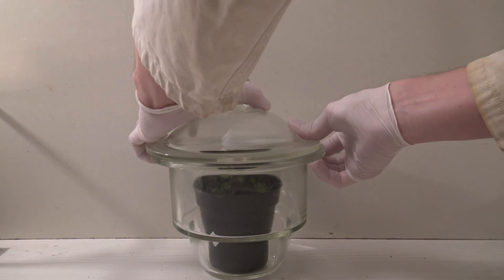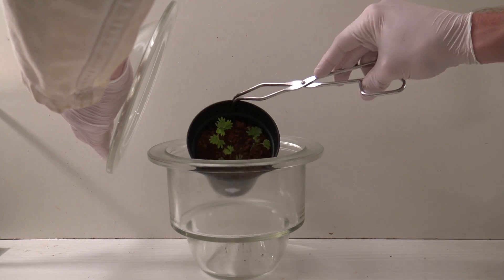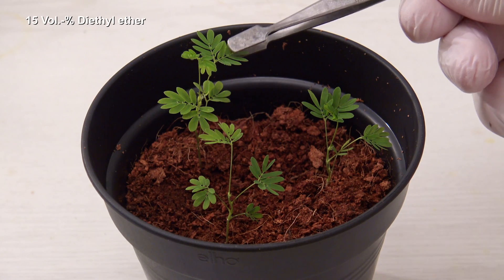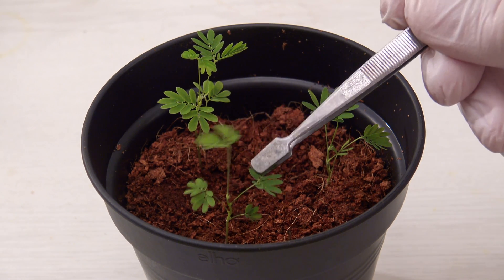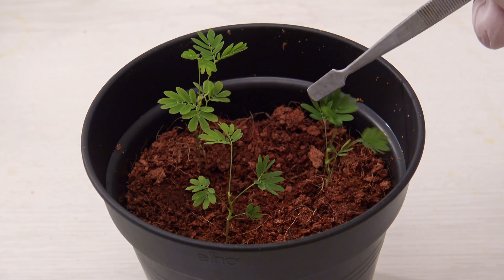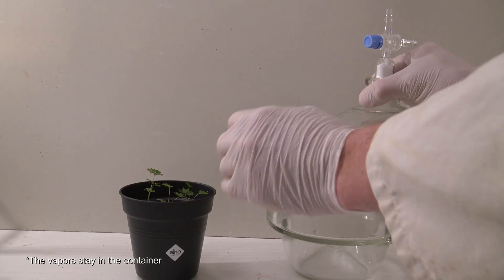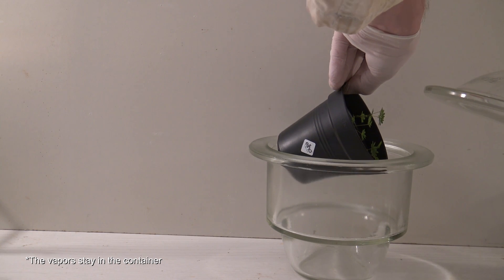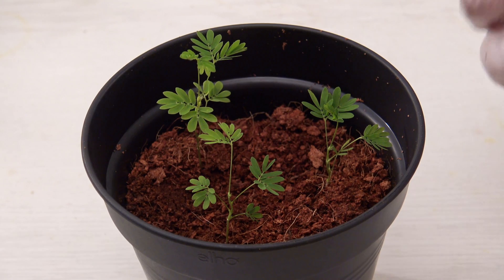Then the experiment was repeated with the Mimosa putica. The same amount of ether was used, but the effect was almost not visible. It was then tried to let the ether evaporate in the chamber first and then add the plant afterwards, but the result was identical.